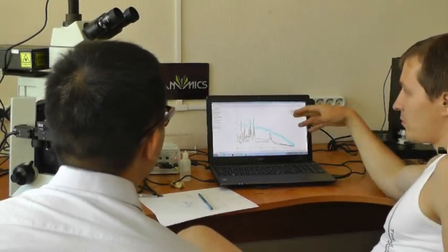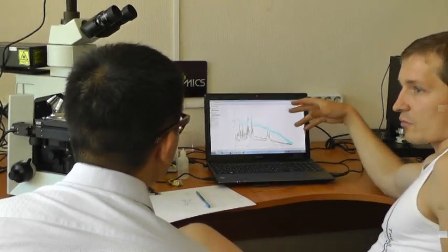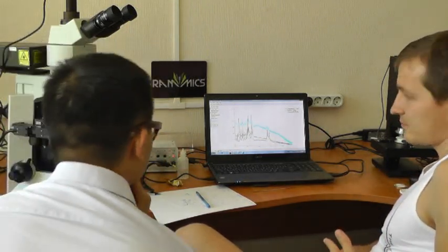But if we were able to wait for 2 hours, we would have 3 or 4 times more spectra, and the statistical deviation would be much less.